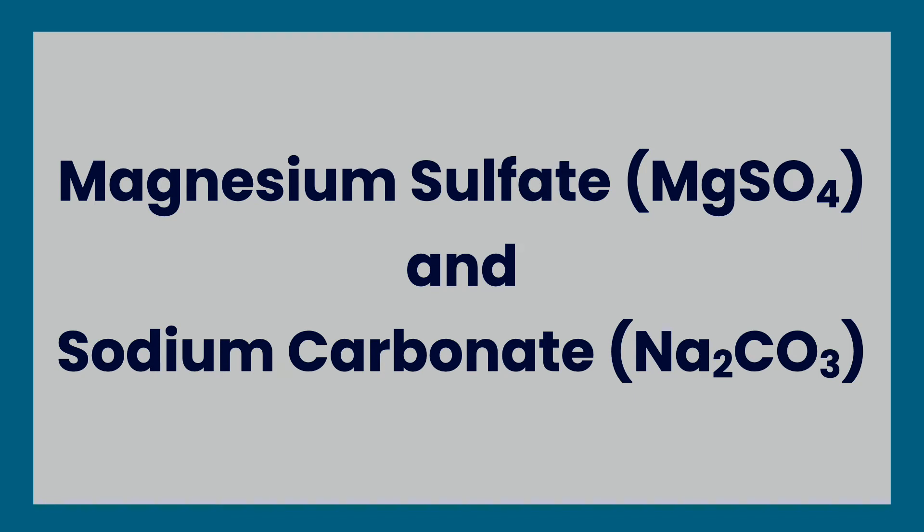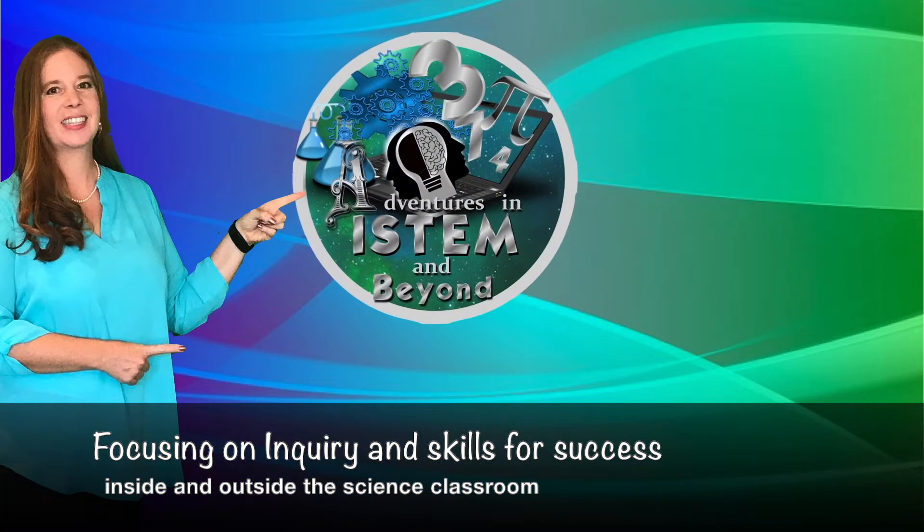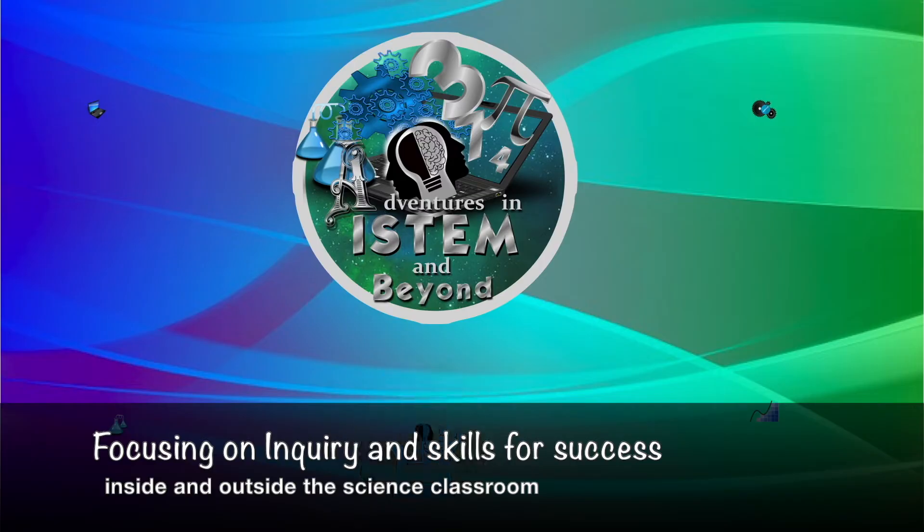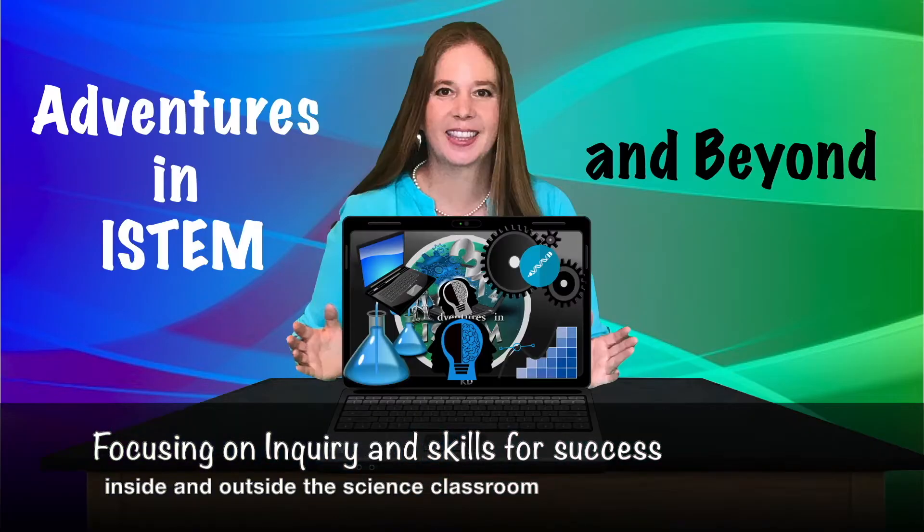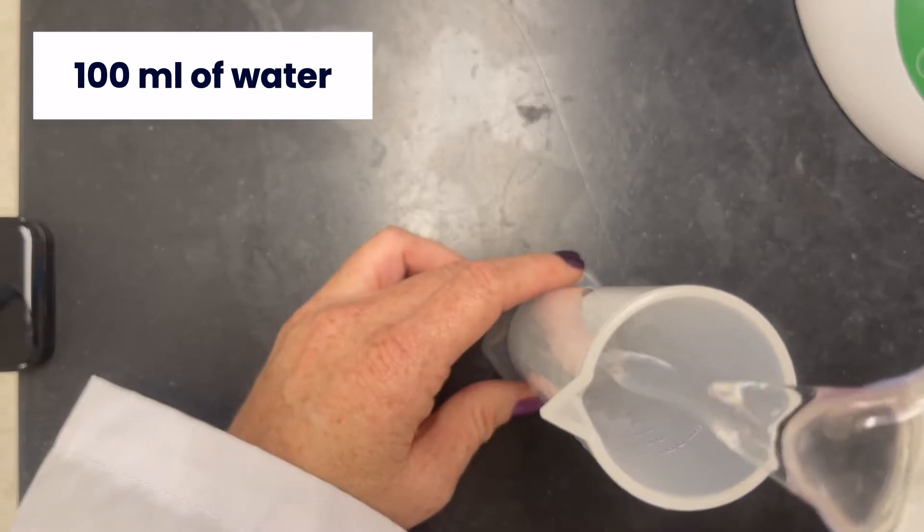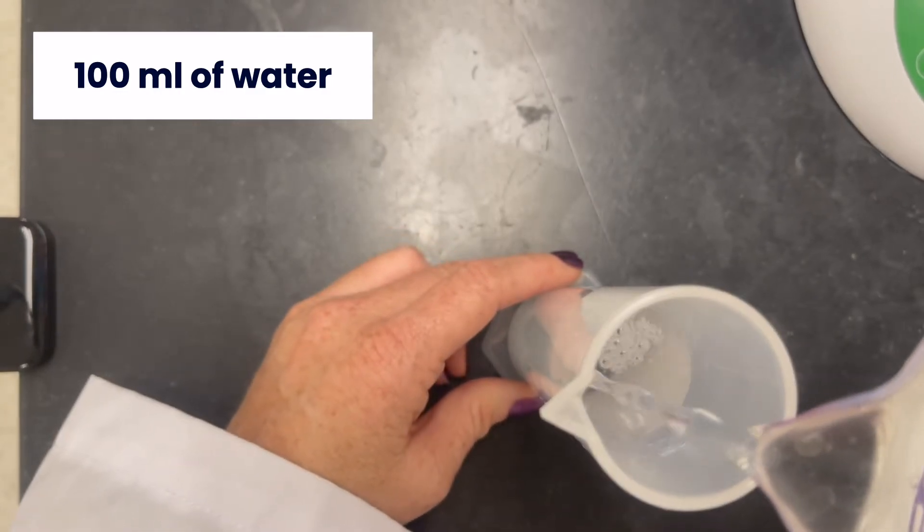Magnesium Sulfate and Sodium Carbonate. First, take 100 ml of water.